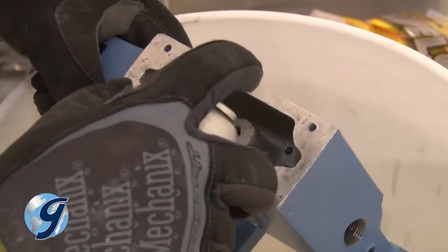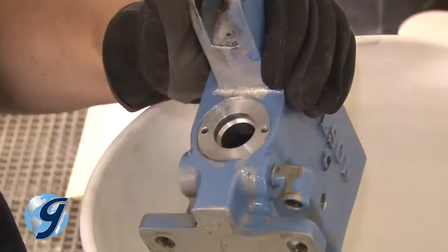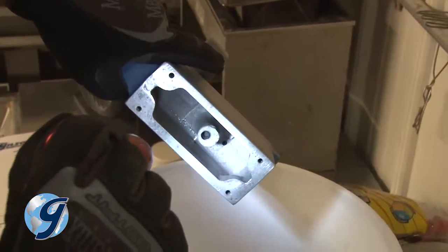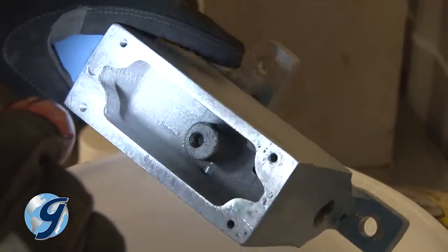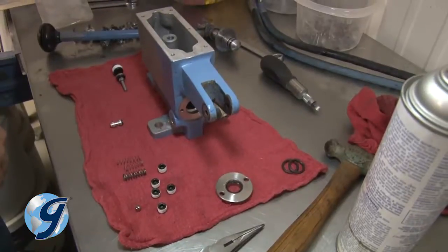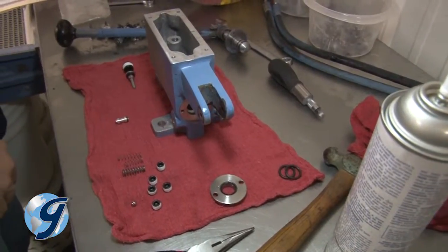Now that all appropriate components have been removed, clean all residue buildup from the pump. Next, inspect the entire pump to confirm that it is completely dry and free from dirt. Now you're ready to rebuild the pump using parts supplied from your Gilson pump repair kit number 2.